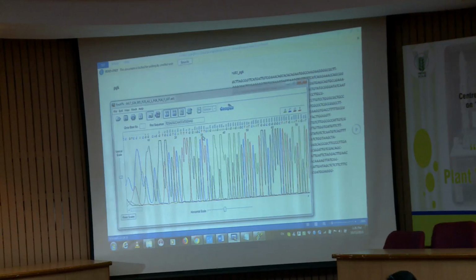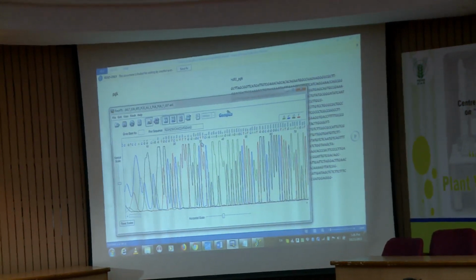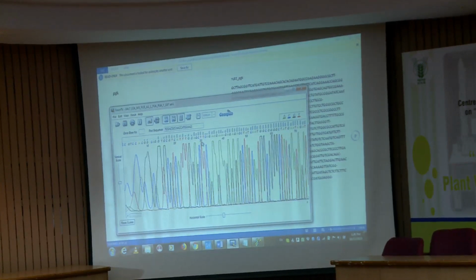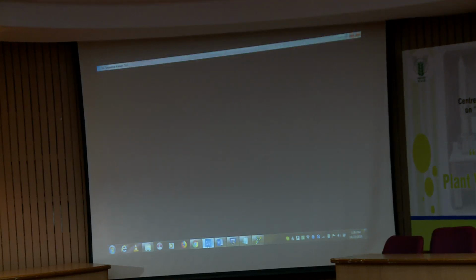So, how does this happen? There is another software, the CLC Sequence Viewer. I will give you one example of how you can do it.